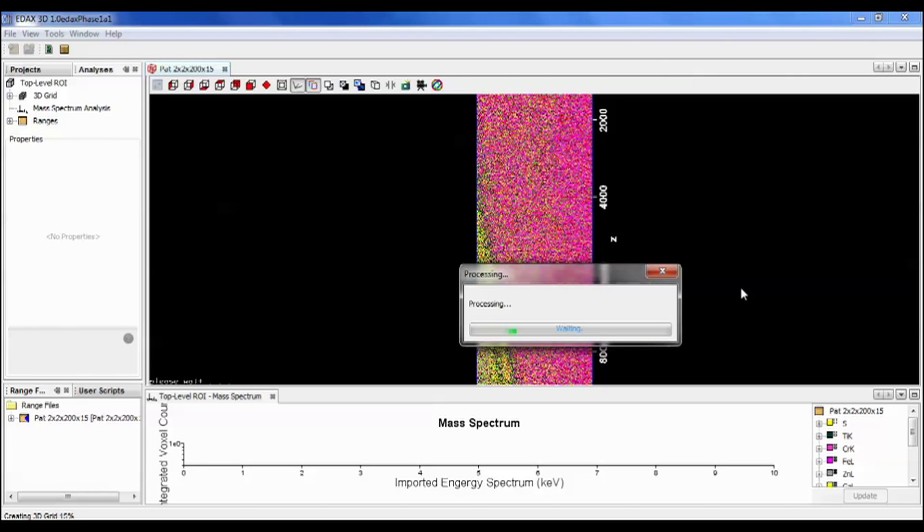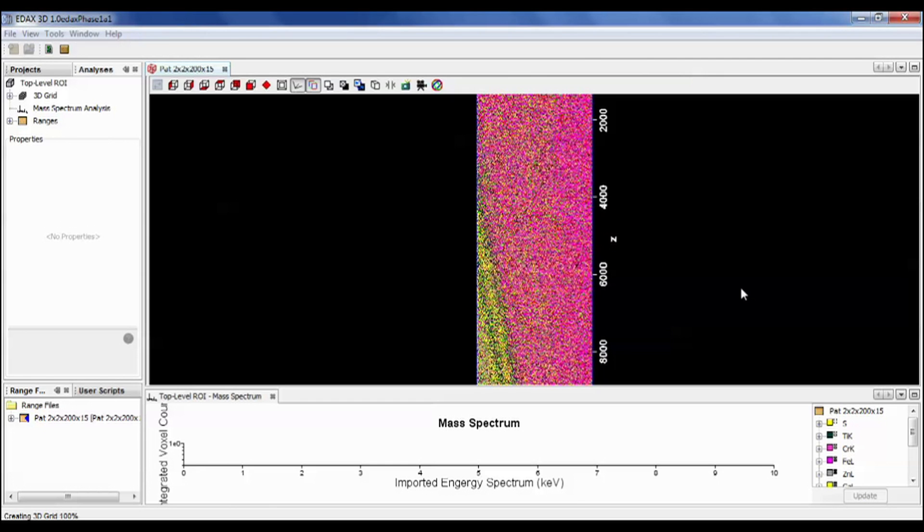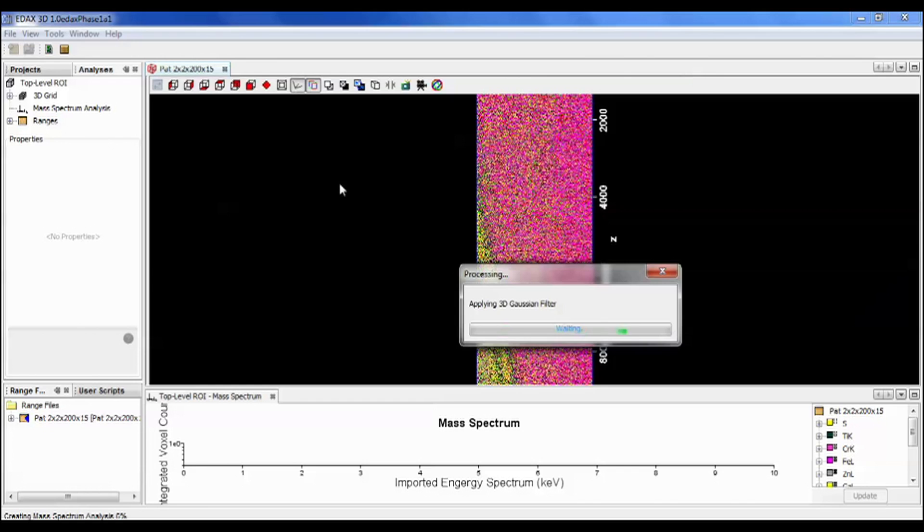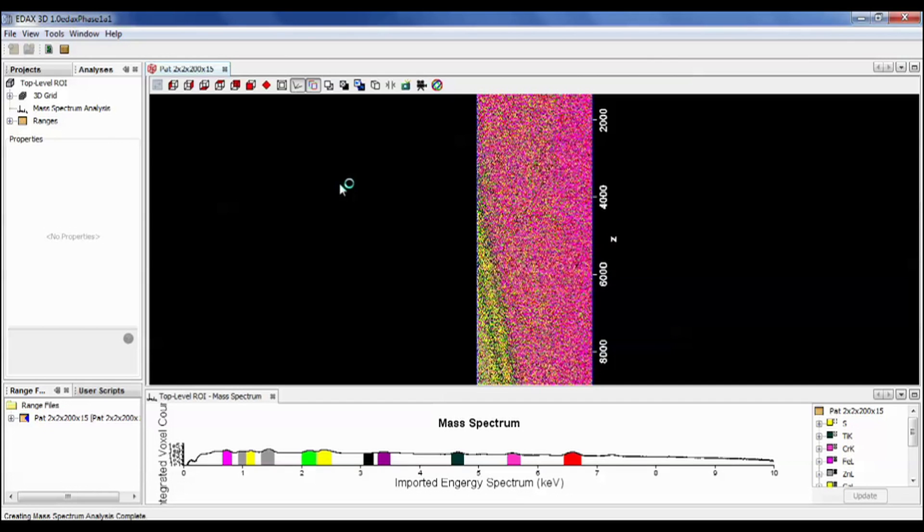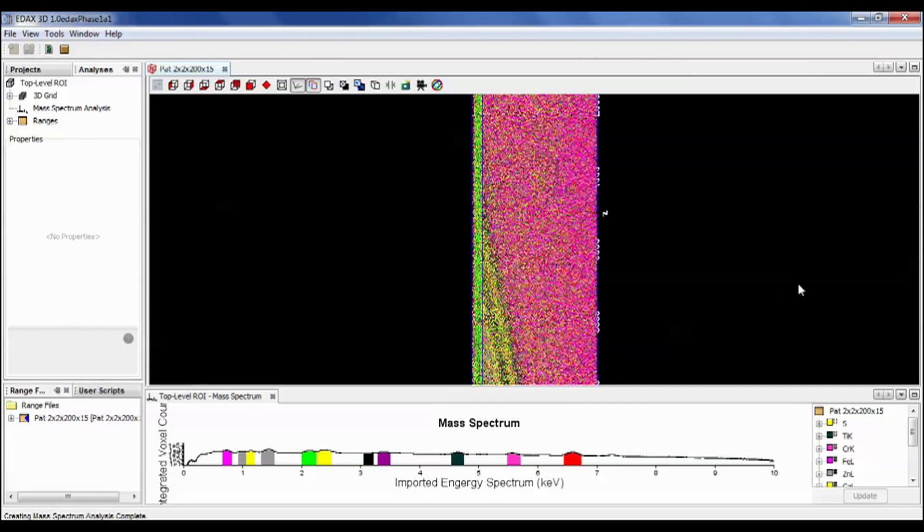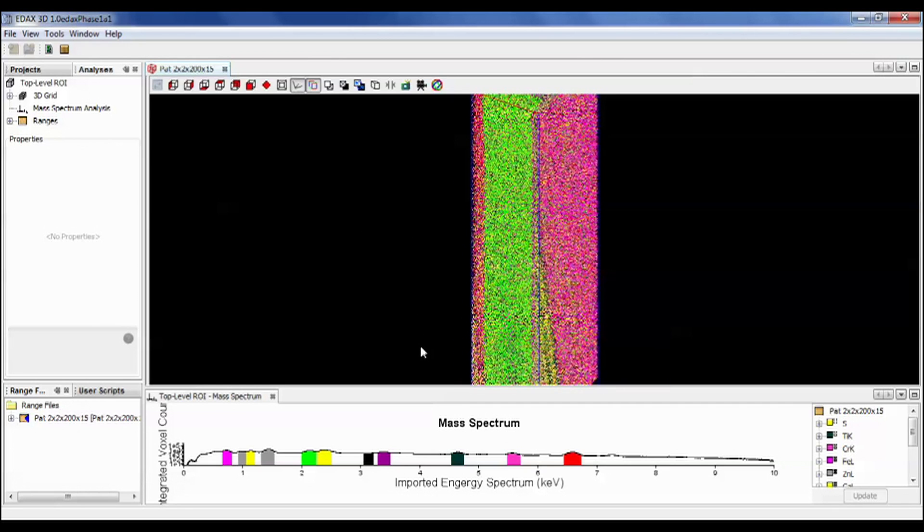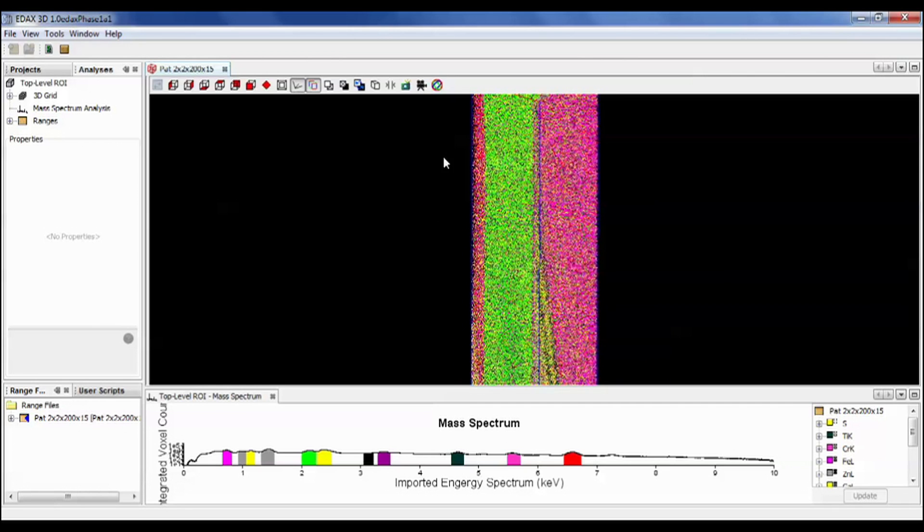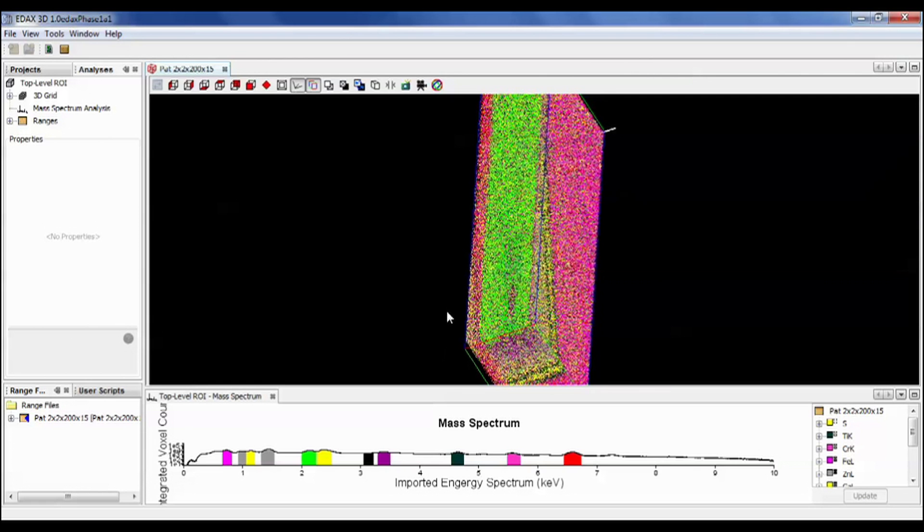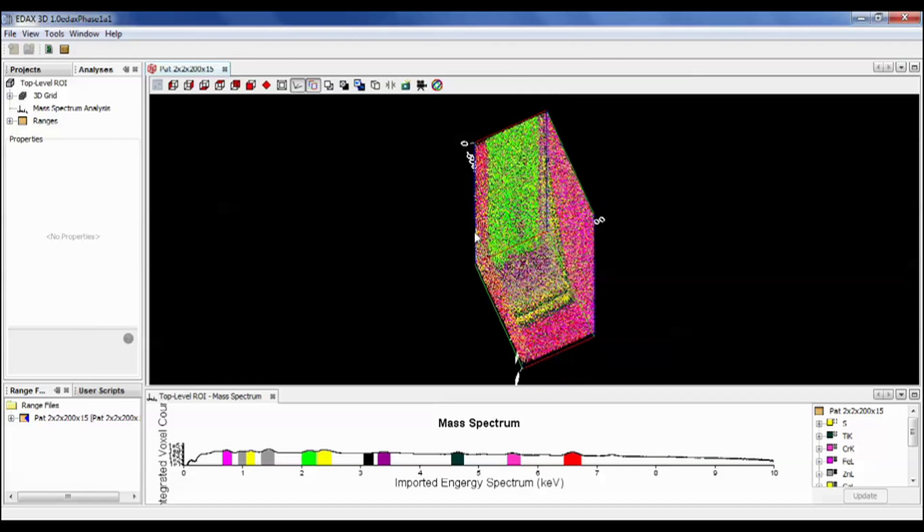So we can see the first indications of the data set with the pink dots and the yellow dots that are in the display, but it's still doing further processing. The cumulative spectrum of all of those pixels will be displayed in the bottom spectrum display, and so that is complete. We can click and drag on the screen to rotate the data set with each of the x-ray energies assigned according to the range that is highlighted in the color listing in the mass spectrum below.